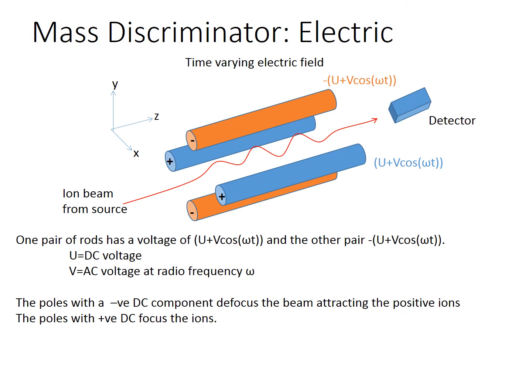So what happens if we just think about the static charges? If you have these positive rods here, we have a beam of positive ions going through. Those are going to repel the ions, because the ions are positive. So that basically pushes the ions in towards the middle, and that focuses down this beam. Whereas this one up here will spread them out, because it's negatively charged and it's basically pulling the ions away from the centre of the current.